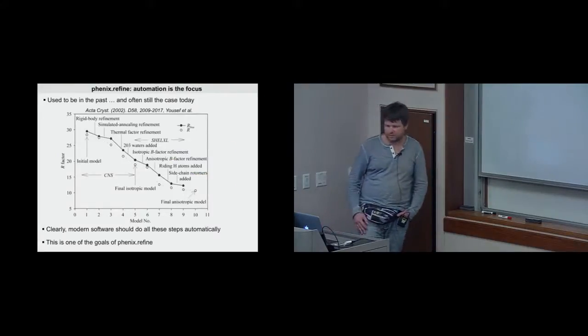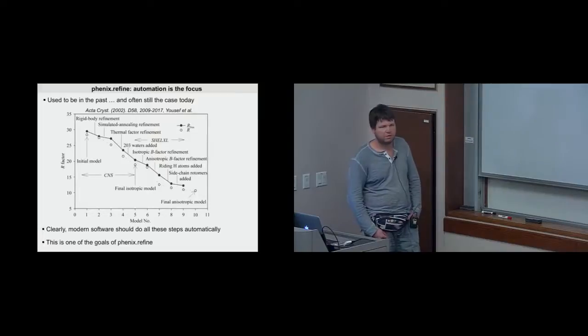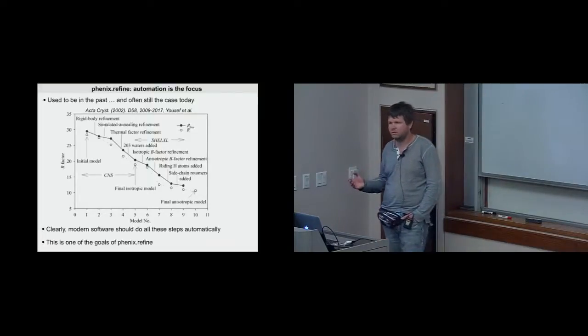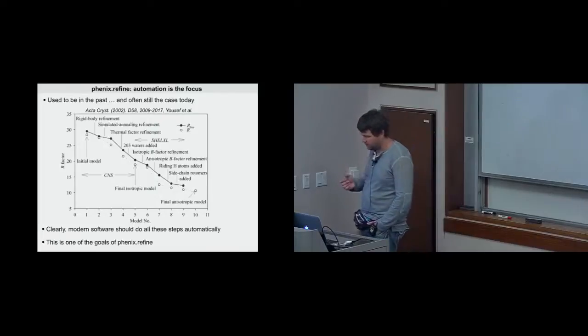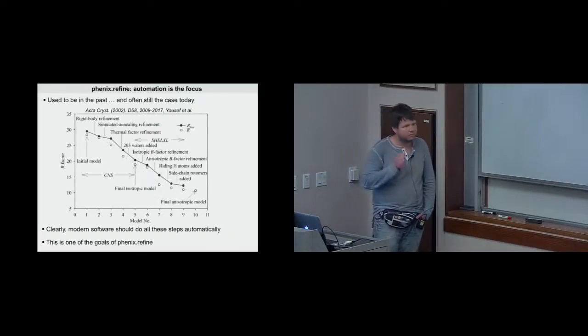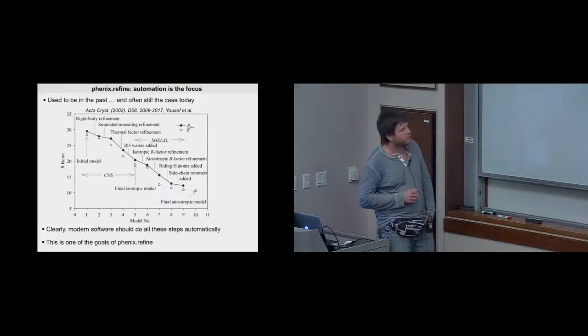As I said, there are tools out there. So how is Phenix.refine different? So what's conceptually, technically different in Phenix.refine? And this slide that I keep showing over years illustrates the basic idea.